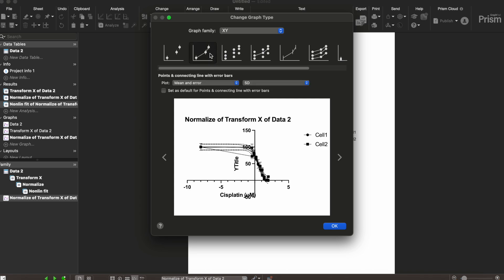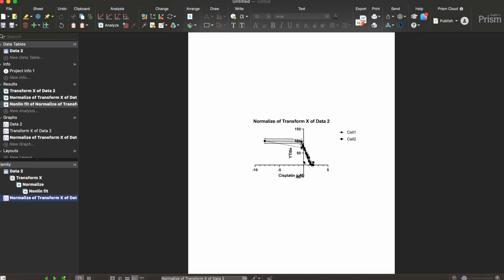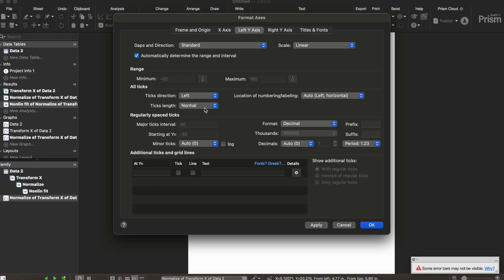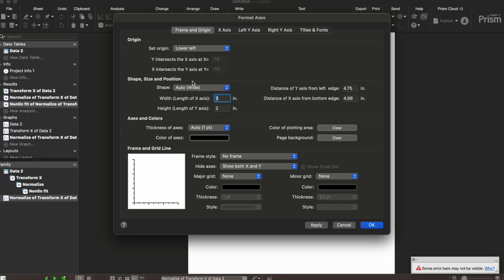We're gonna make the graph be a points and connecting line with error bar graph plotting the mean and error. So I'm gonna push ok and then we're just gonna format the graph so it looks nice and pretty. First we're gonna go to frame and origin and we're gonna set the origin to the lower left. And then the shape will be auto wide.